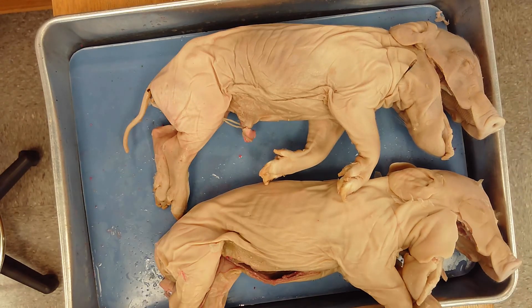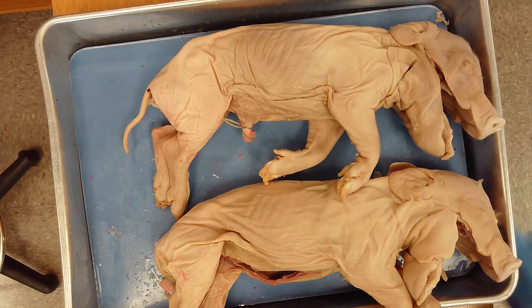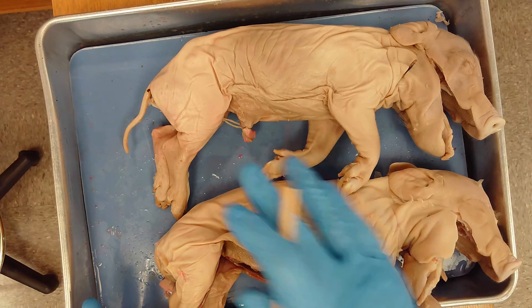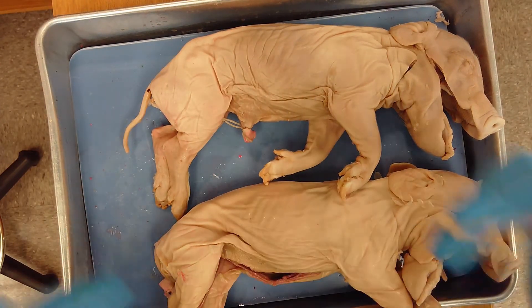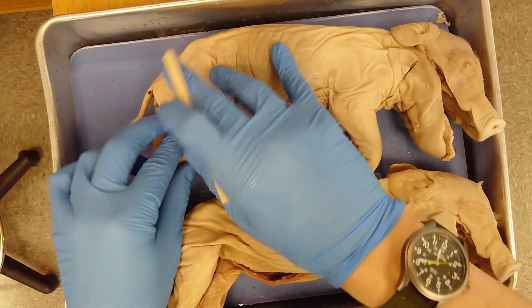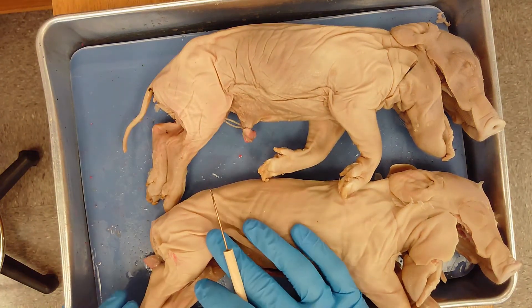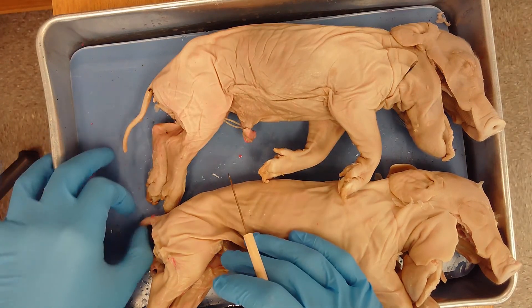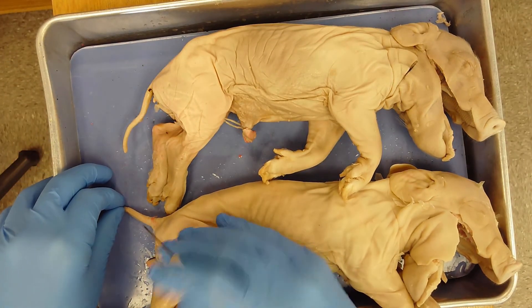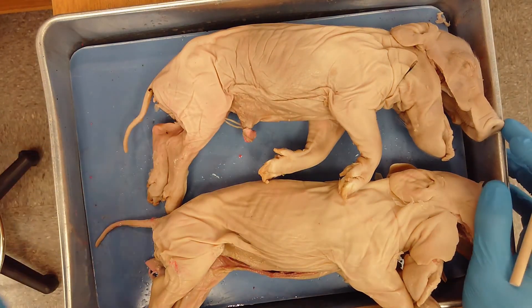The first thing was to sex your pig to determine whether it was male or female. Females have a urogenital papillae that's closer to the anus. We have a female up top and a male on the bottom. Beneath the tail we have an anus, and then a small protrusion which is the urogenital papillae. On the male there's no urogenital papillae near the anus.